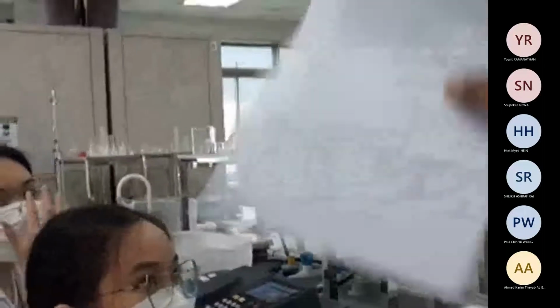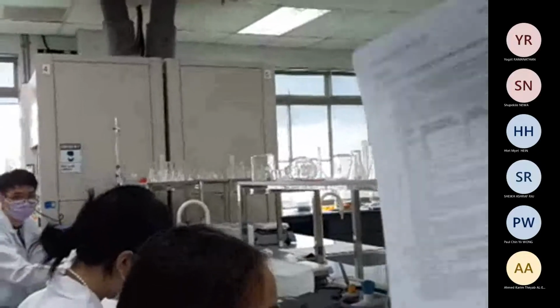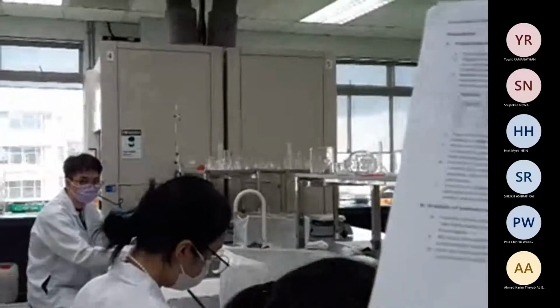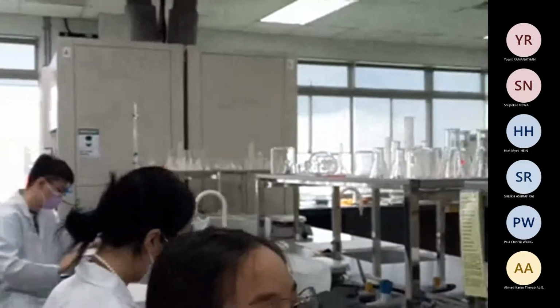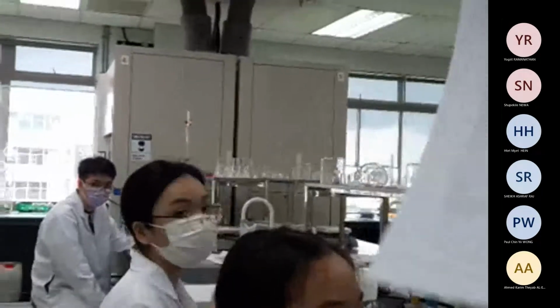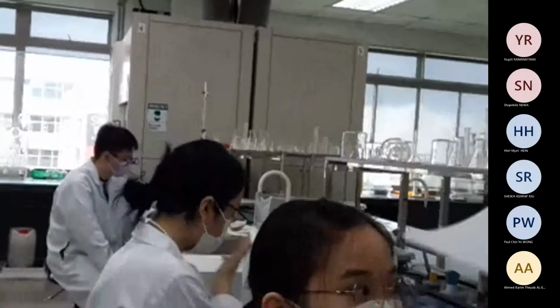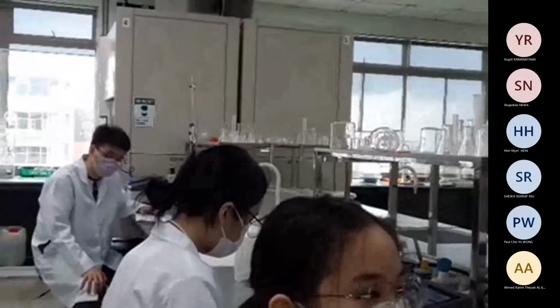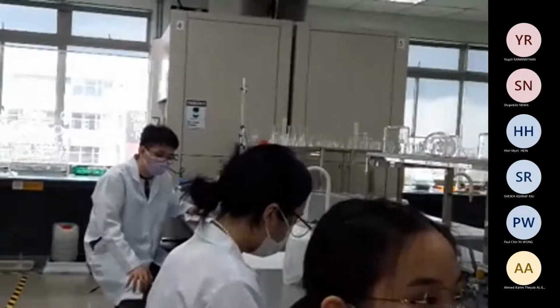But the ferric chloride is always 5 milliliter. So it is easy to take, and you will not make much mistake taking 5 milliliter each time. But when you are taking 5, 10, 15, 20, be careful. Because if you are off by even 1 milliliter, then this is your standard, you are preparing the standard. If any of your standards is not correct, then finding the unknown is also not that correct, right?